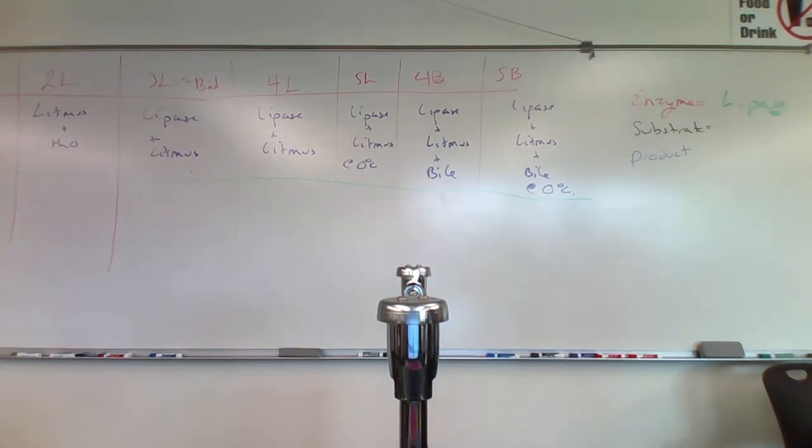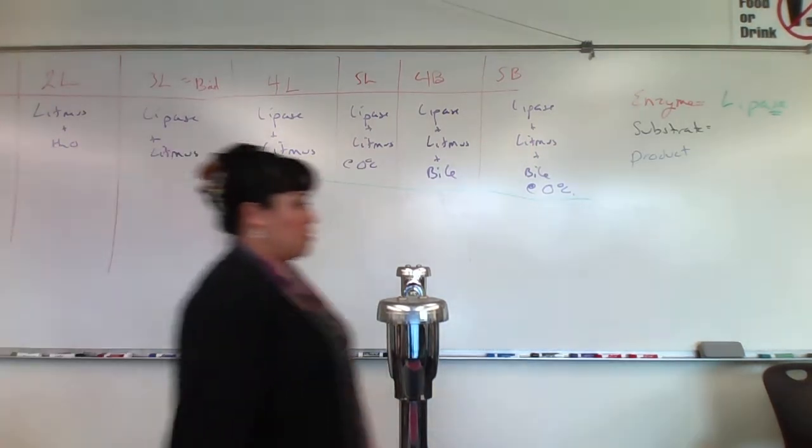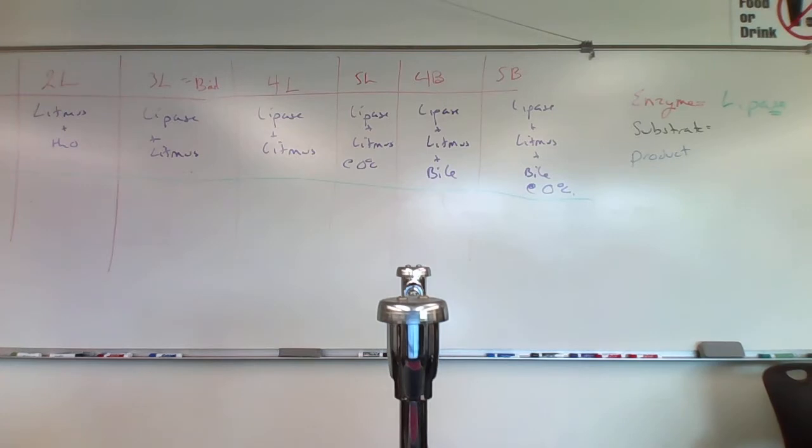Yes, those are... it's supposed to be body temperature. So hotter than warm.